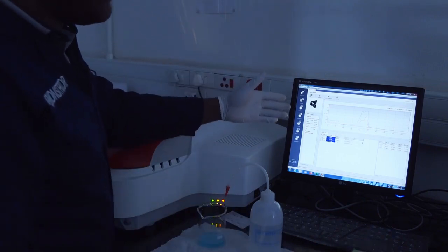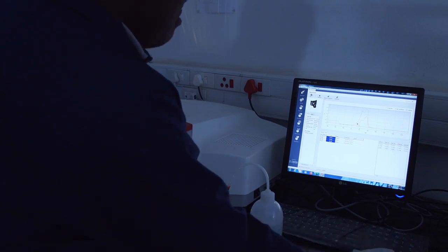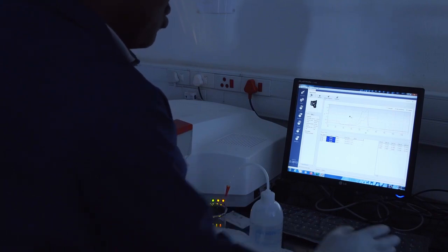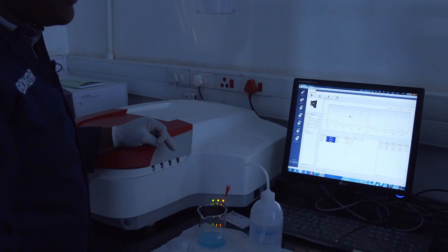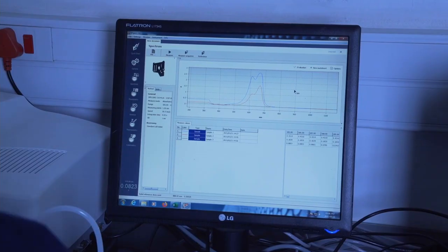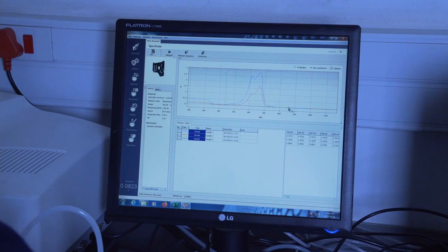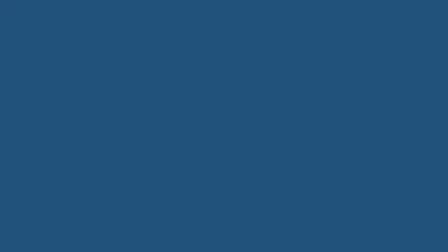As you can see, after just 10 minutes reaction time, all of the methylene blue dye has been photodegraded. Here is a zoomed-in version of the UV-Vis spectrum — as you can see, it is at zero, indicating that our photocatalysts have successfully photodegraded the methylene blue dye. Similar steps will be taken in the photodegradation of methyl orange dye, and this concludes the video of the photocatalytic degradation of methyl orange and methylene blue dyes.